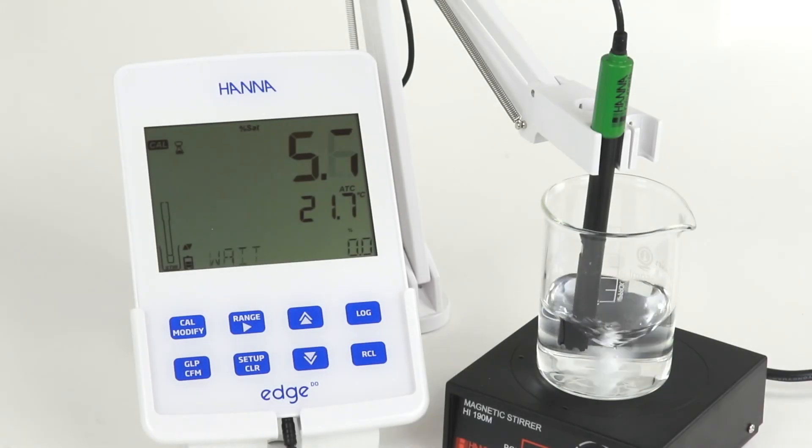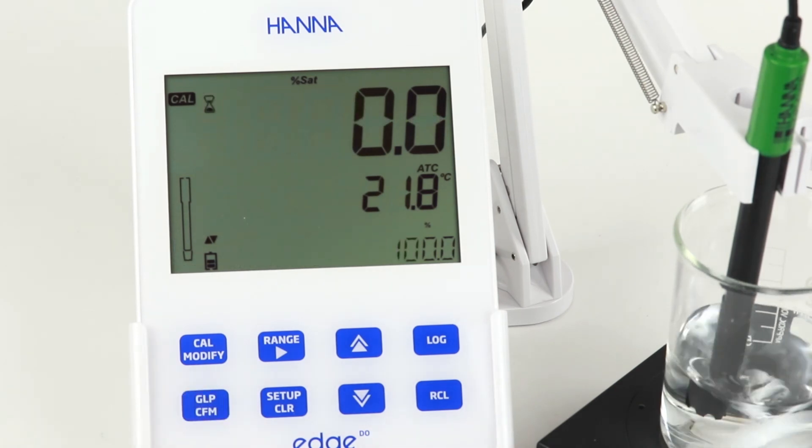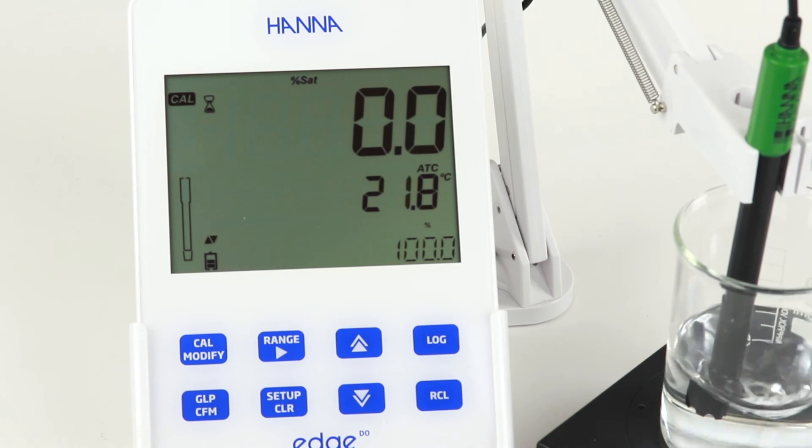For calibration at a second point, simply submerge the probe in about 60 milliliters of zero oxygen solution. Be sure to use a magnetic stirrer for best results. Once the reading is stable, press Confirm to accept the calibration point. The meter automatically saves the second point and returns to measurement mode.